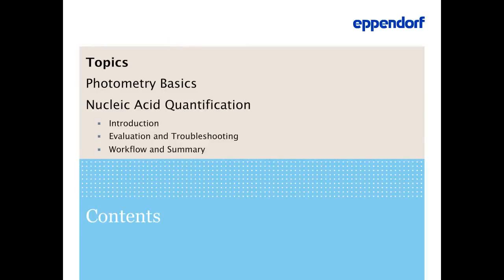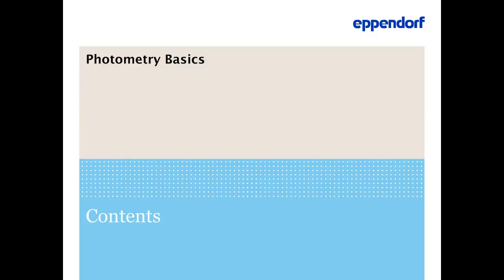My presentation today will focus on the topics photometry basics and nucleic acid quantification. Regarding the latter, I will cover the introduction to the method, evaluation, and troubleshooting, as well as an overview on the workflow, together with a summary. First, we start with photometric basics now.